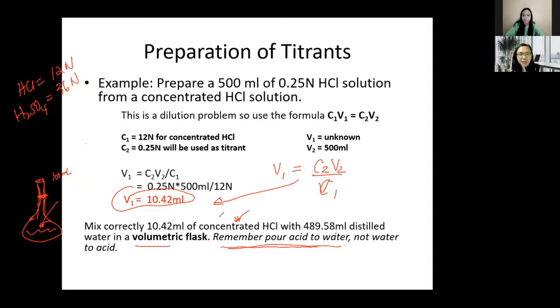Aside from that, safety precautions, those fumes can cause permanent lung damage. So yun yung iniiwasan natin. Okay, those fumes, imagine that's hydrochloric acid, that's acidic. So kung maglalabas yan ng fumes during the preparation, tapos ma-inhale mo siya, magkakaroon ngayon ng butas-butas yung iyong lungs. Okay, so that's the very, very pinakaunang reason bakit hindi pwede natin kalimutan yan. Okay? So that's the preparation.